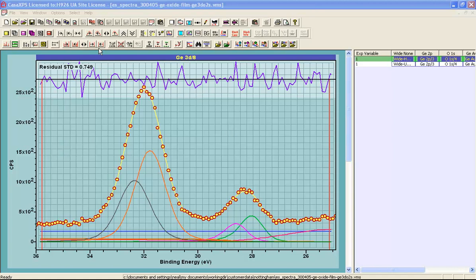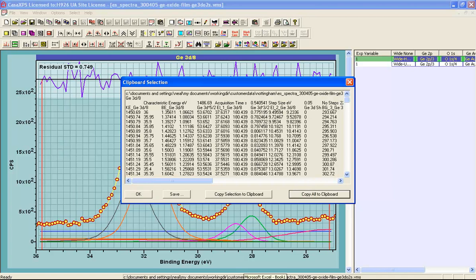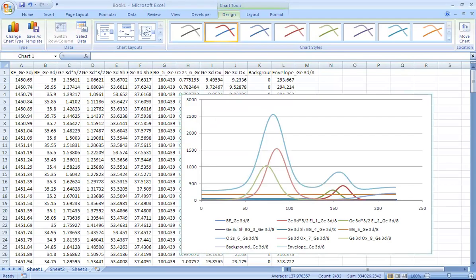The option that we're going to explore in this video is this toolbar button which allows the export of the peak model plus the data. This is via a clipboard dialog window which can be selected and then pasted into Excel.